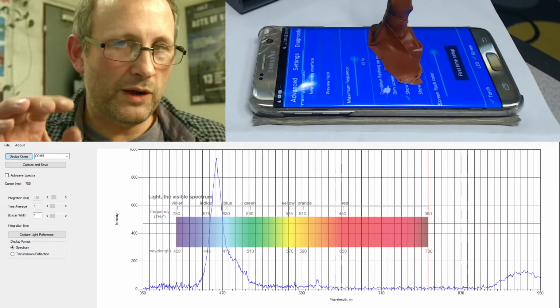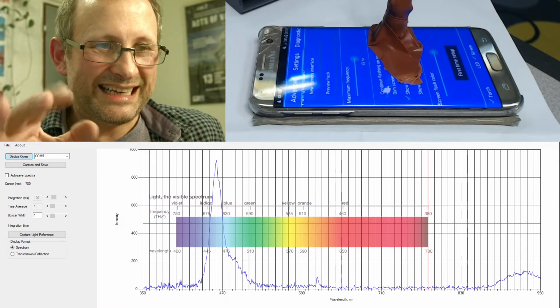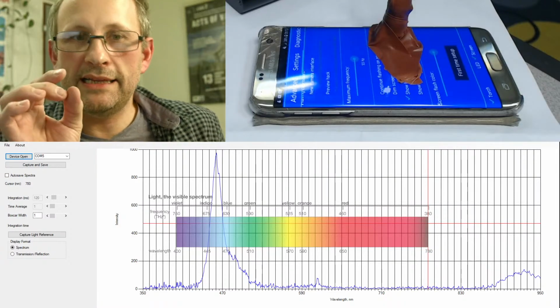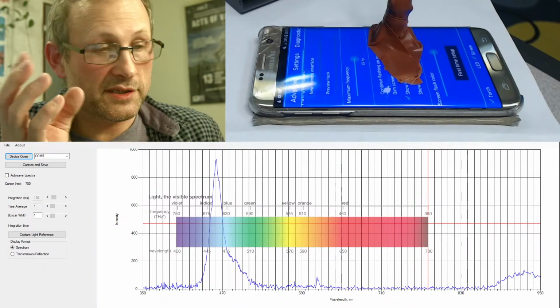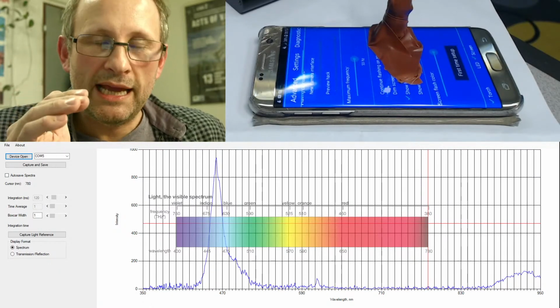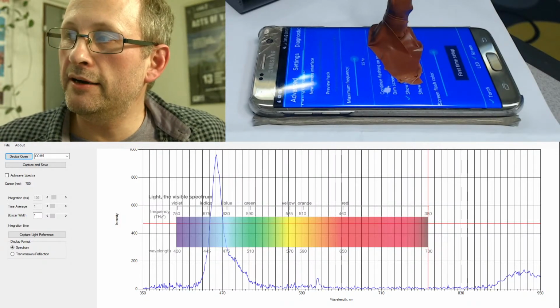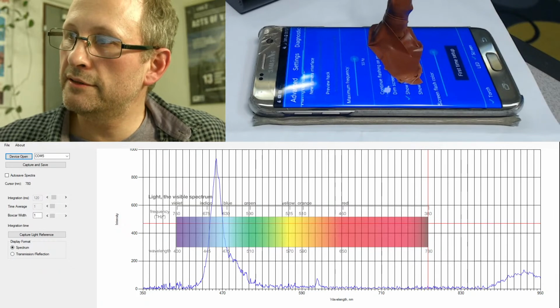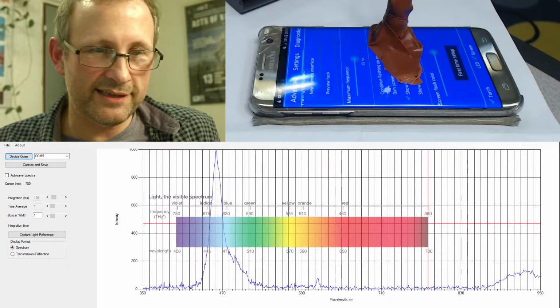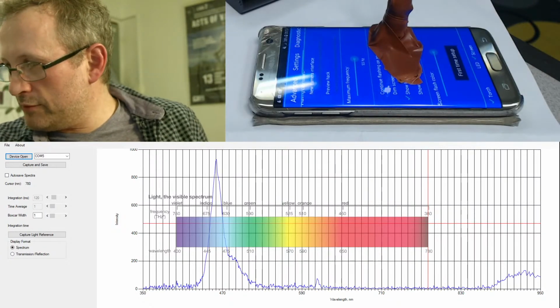So one thing about blue LEDs, they were very hard to achieve. They were the last LEDs to be effectively made. And it might be that they typically, well, certainly the ones that I've used in the past, required more power to drive them. And so you could imagine that they would run hotter. So this actually might be heat, IR, not visible, but IR that's coming out of the blue LED that's producing this blue look here. Okay, so can everyone see what I'm showing there?